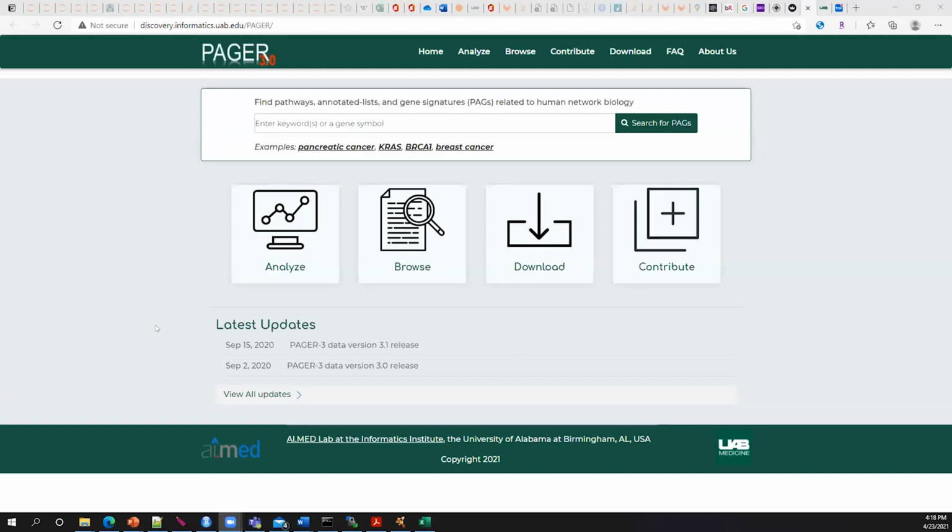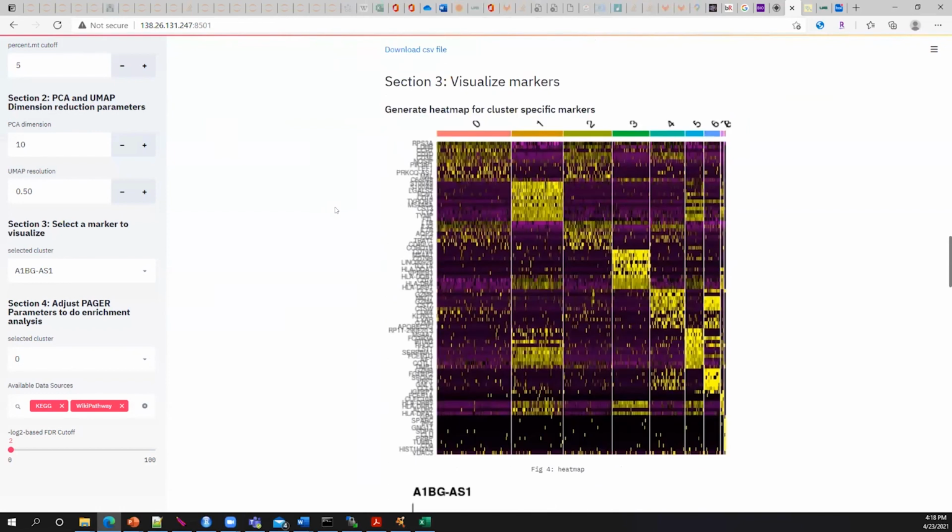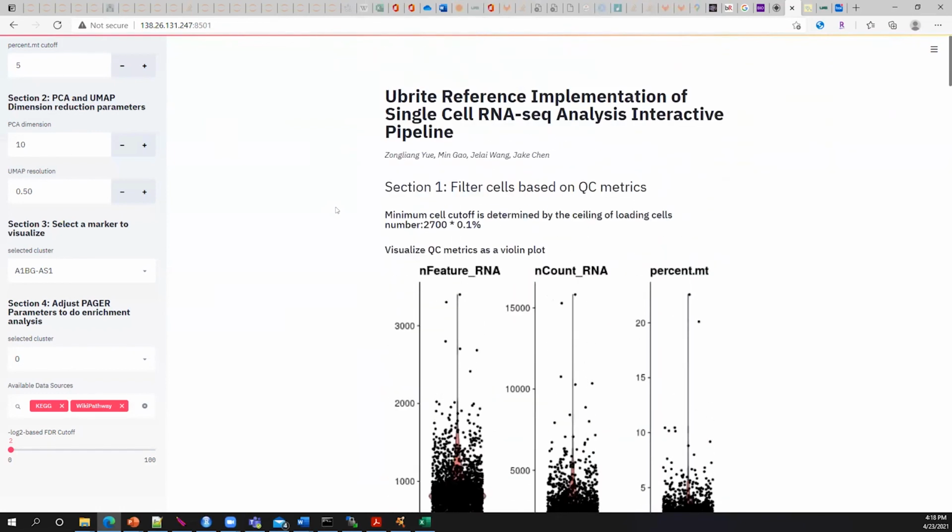Yeah, I was asking if the platform you just described for single cell analysis is in the AI lab. Oh, yes. So currently this app for single cell analysis, we are running it in Streamlit and also implement our code here. Also, we have the official website for the PAGER analysis, not limited to single cell, but also bulk analysis or tissue specific gene expression.